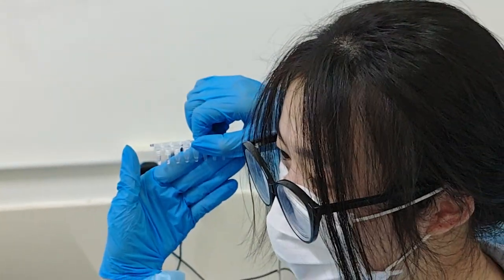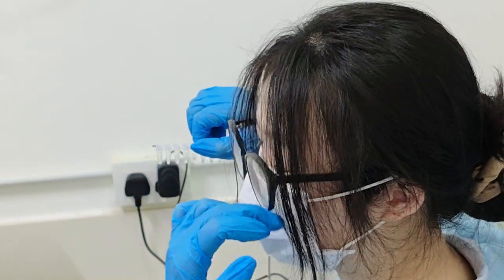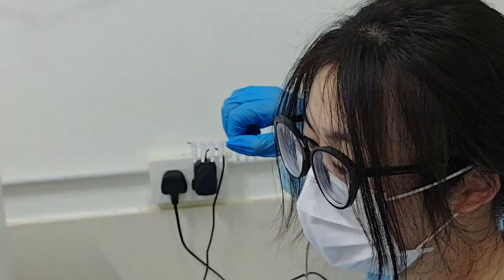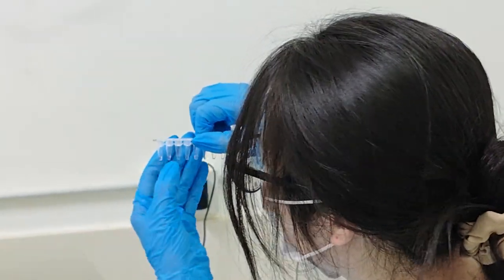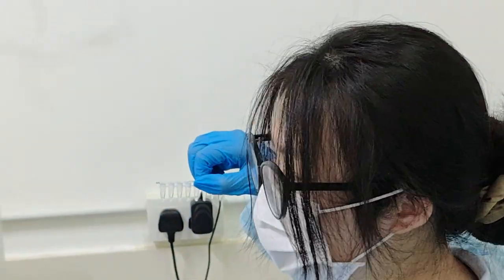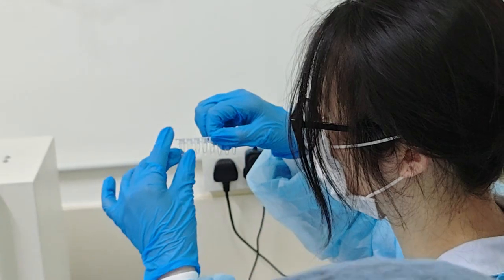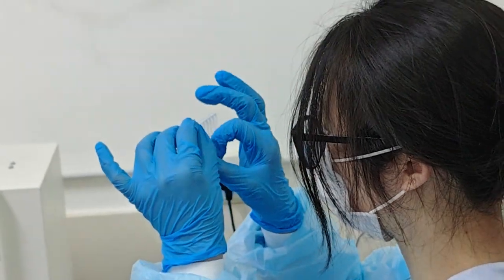You see, one is checked whether we have added template because the level height is different before you add template, after you add template. Yeah, and the second thing is to check whether there's bubbles. If you have bubbles, the PCR reaction will be very slow. So we need to clear out bubbles.